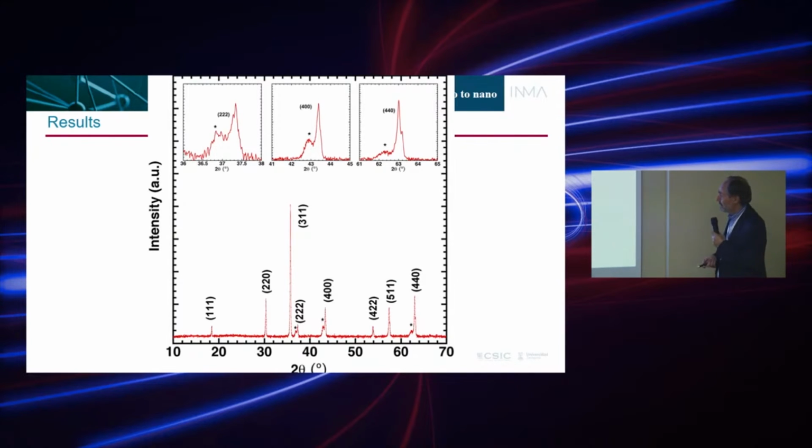And this is the X-ray diffraction of these nanoparticles that show that we have the nickel ferrite. So we have kept the nickel ferrite composition, even though we have made the nanoparticle go through this very aggressive ablation process. But we are doing it in sub-nanosecond regimes, which are relatively respectful with the material.